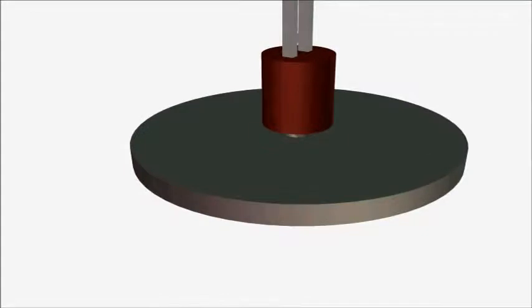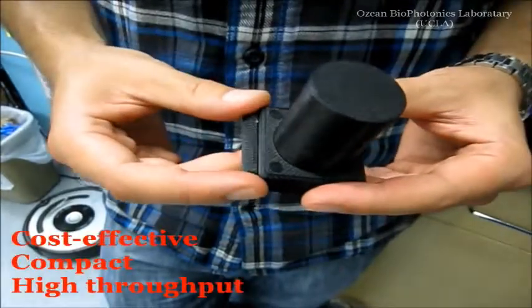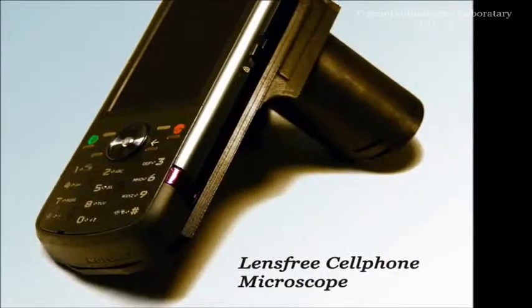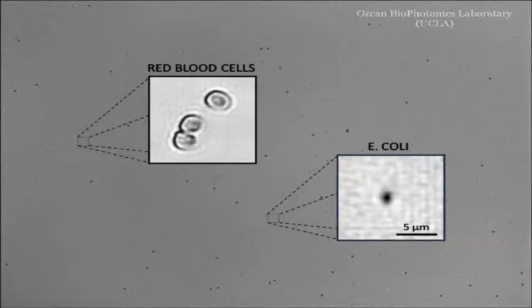The enabler for this is, of course, computation, but the other enabler is the CMOS Imager. You're recording me through a CCD, but what we have, the equivalent of that on cell phones, is a CMOS Imager. It's a silicon chip that is maybe half a centimeter by half a centimeter, and that has so many small pixels that are sensitive to light. And that's how you record images. The CMOS industry has done a fantastic job of making these cell phone cameras so advanced with so many megapixels, so small pixel sizes. That enables us to really use them as a fantastic computational microscope that can remove the function of a lens and bring in computation to make up for the lack of complexity.